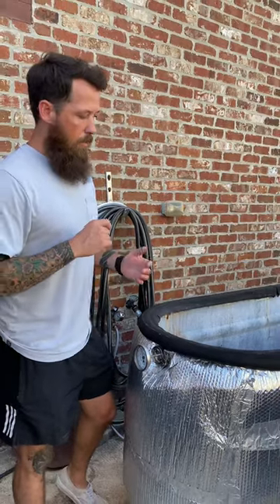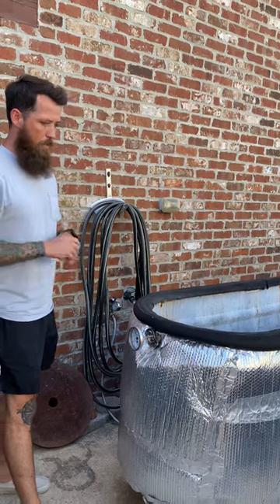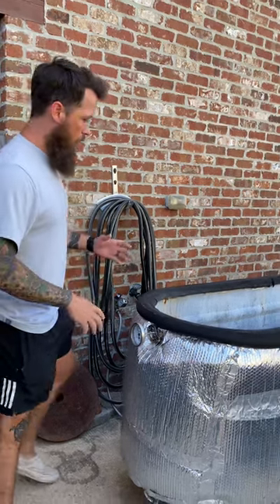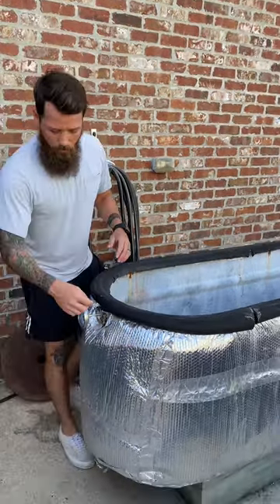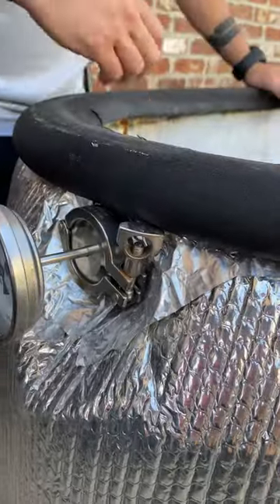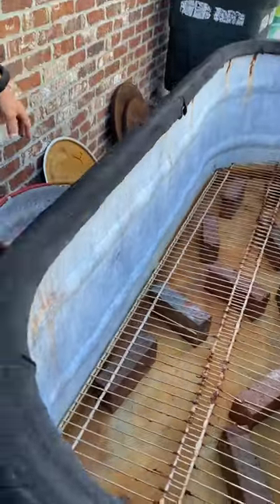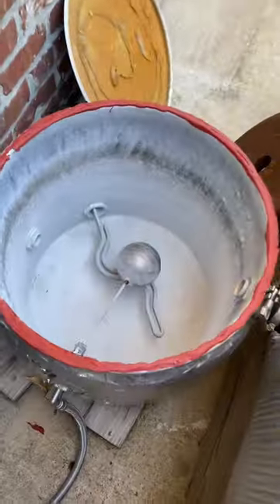We had somebody reach out asking how we built this. We have another video further down that shows it, but essentially here's a quick overview. These are all brewer's fittings to connect everything — the temperature gauge, the heating element — all connected with tri-clamp and different types of brewer's fittings.